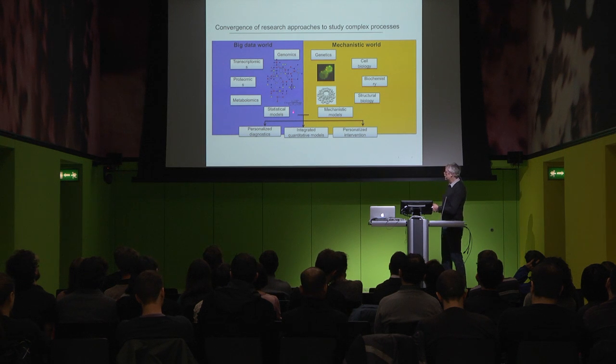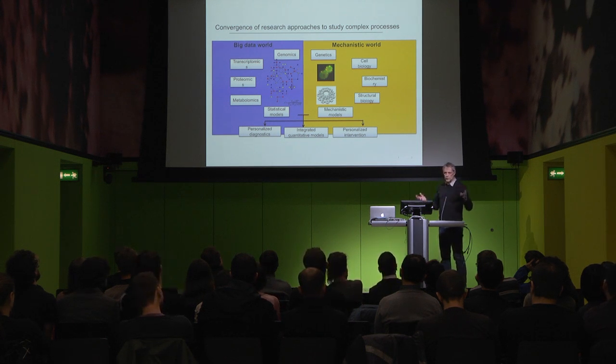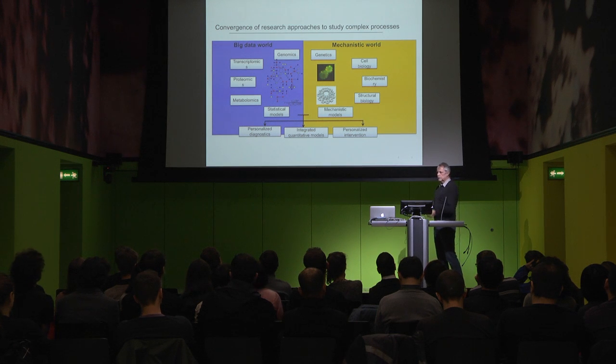We can certainly do rather large-scale data sets. We can now run hundreds or soon probably thousands of samples and generate very nice data by DIA methods. And we can do, of course, relatively small numbers of proteins, very targeted in specific biological context.